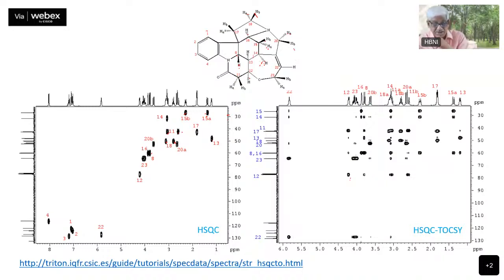Yeah, 8 is also possible. 12 to 8 is also possible. 15 is missing. And which one is this one? 20. Can it go to 20? No, sir. Which is that? 11, is it? 11B, where is 11? 11 is possible. 11 is first, so that is the next one. So 11, 12, 13, 14. So you have that kind of correction. And 8. So therefore, you see, this kind of analysis is going to be extremely useful for arriving at the structure.